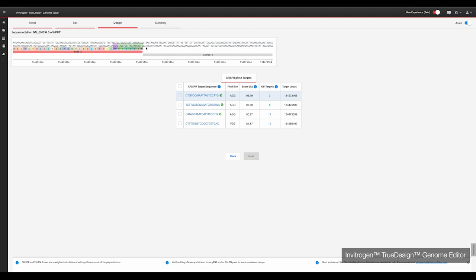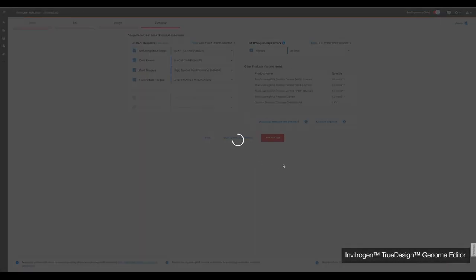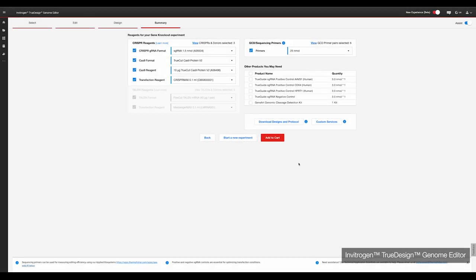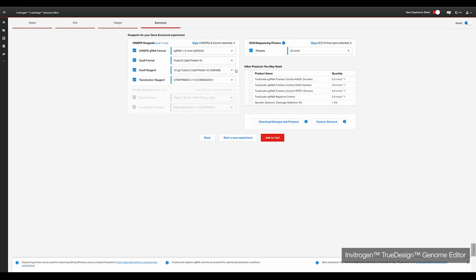Clicking on each gRNA will show you where it lines up within the site of interest, with the PAM site highlighted in the purple box. Simply select the gRNAs you wish to use via the checkboxes. Clicking next will take you to a summary page of the reagents you will need for your experiment. Simply select or deselect what you need via the checkboxes and use the drop-down menus to choose the amounts. The software also includes the option to add positive and negative control gRNAs for your experiment. These verified gRNAs are great for optimising your experiments for a new cell type.